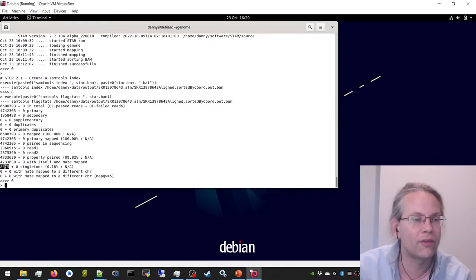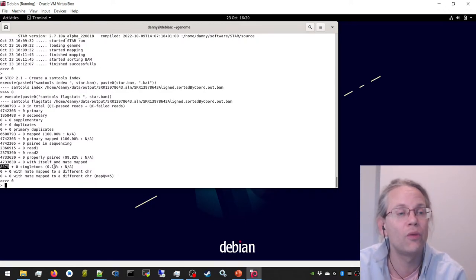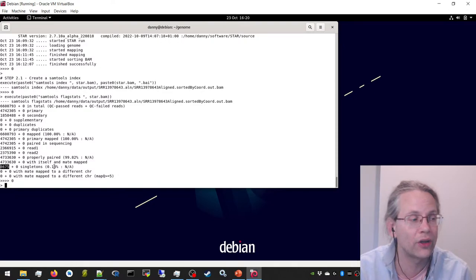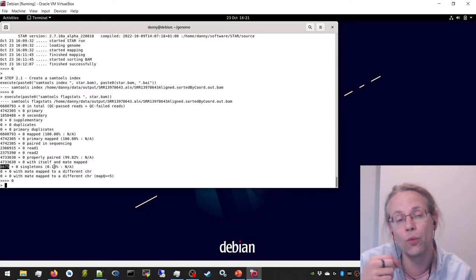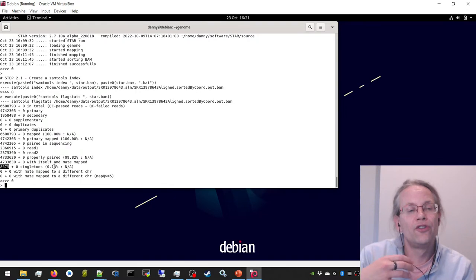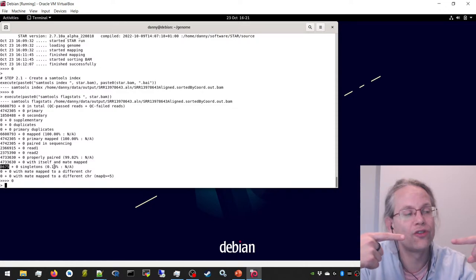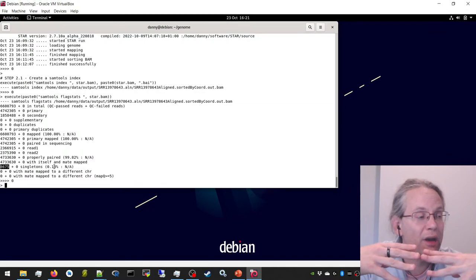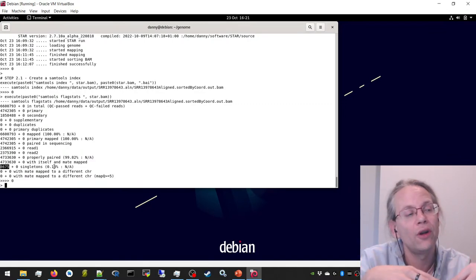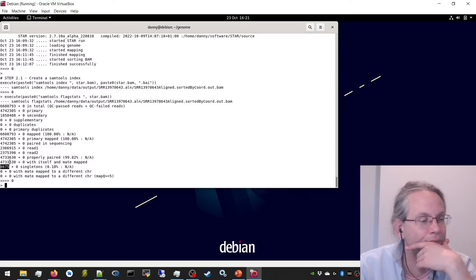Only 8,675 reads were paired end reads where only one of the two was mapped. So those are called singletons after alignment, right? So that's the problem here, Leo, with the wording, right? Singletons are generally the read that remains when the pair does not align. But Trimmomatic uses unpaired because there's no alignment yet at that point, right? So 8,675.